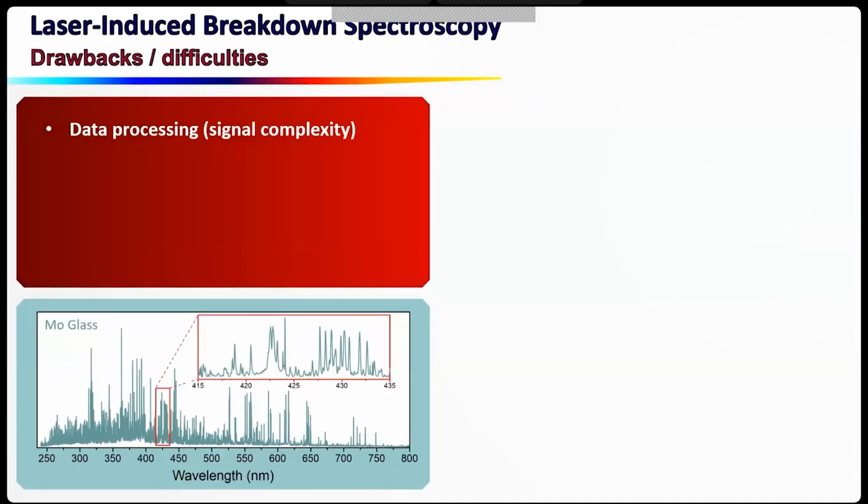Now the drawbacks, the difficulties. There are a lot, in fact, because you have to know that this technique is not new. This technique is quite old. It was probably one of the oldest elemental approaches. It appeared just 1 year after the first laser, in 1963. So it's a very old approach. But as I present it, I'm presenting it like it is a new technique and so on. No, it's not true. It's a very old technique. For most of you, you did not hear about this approach before.